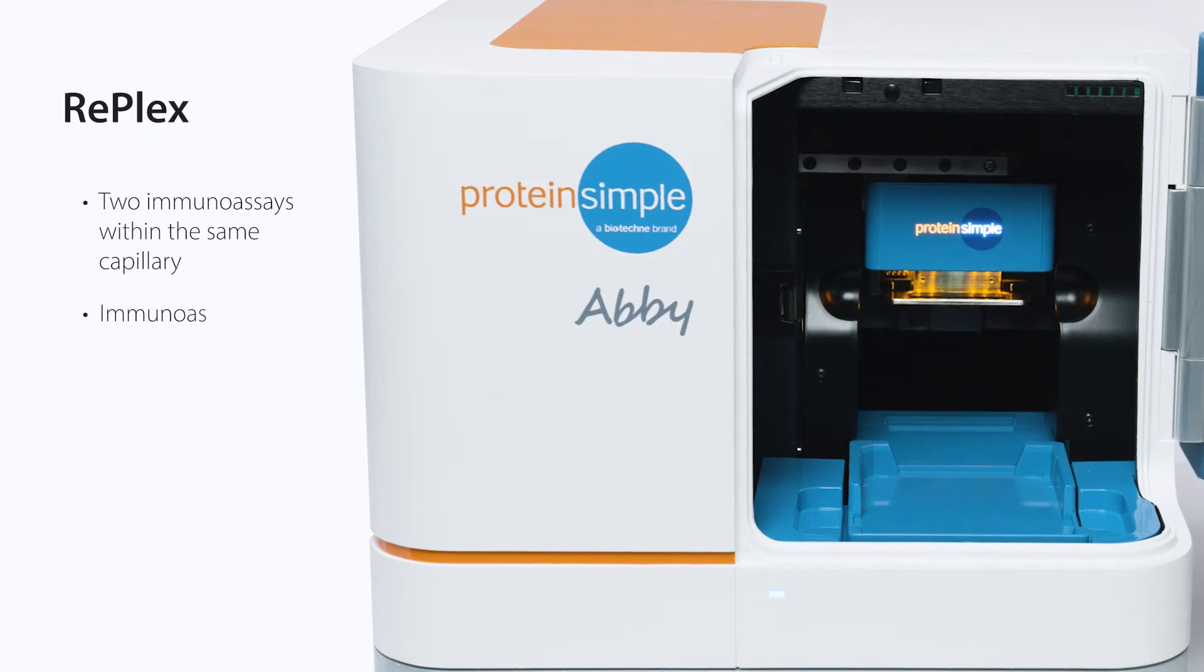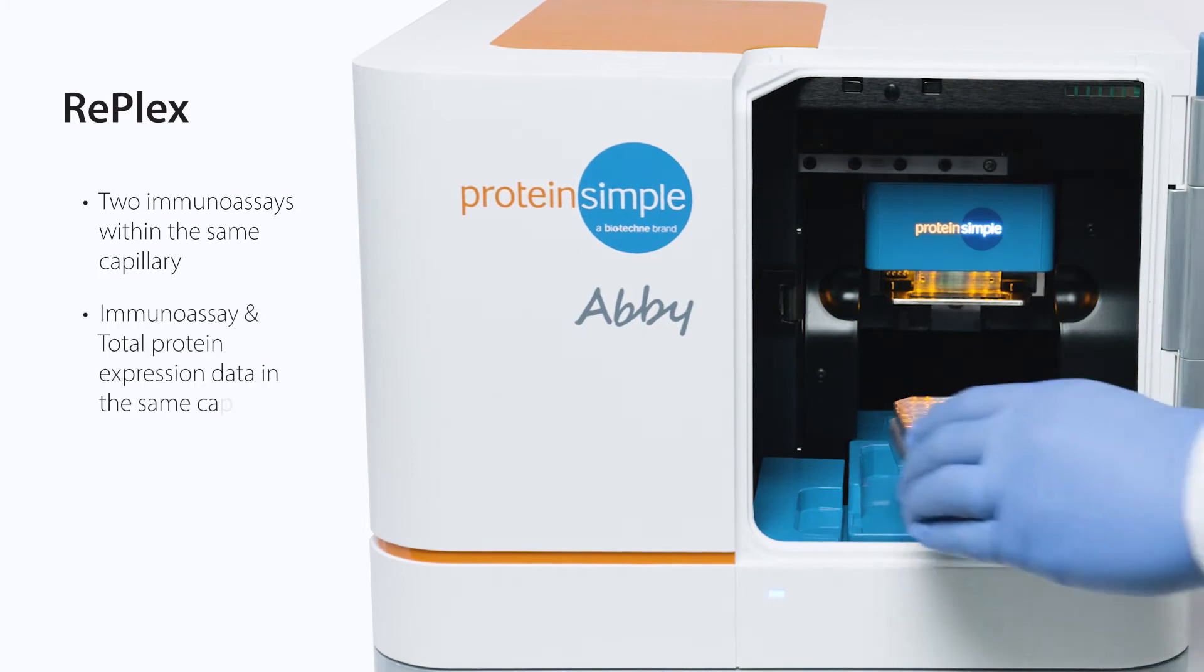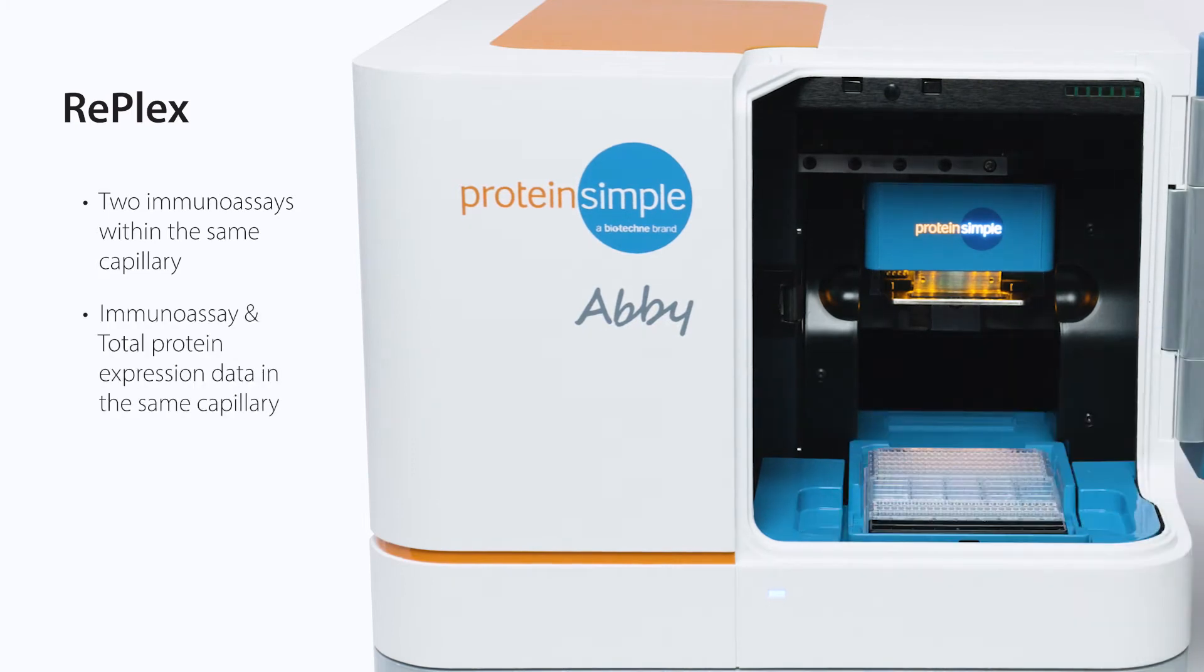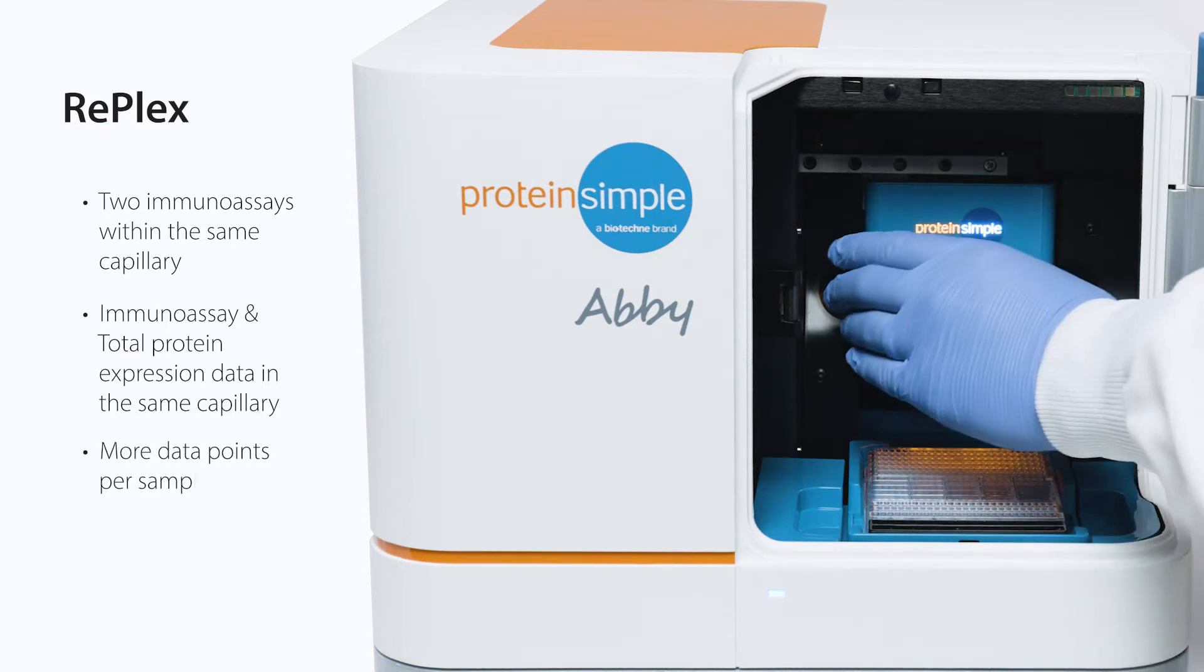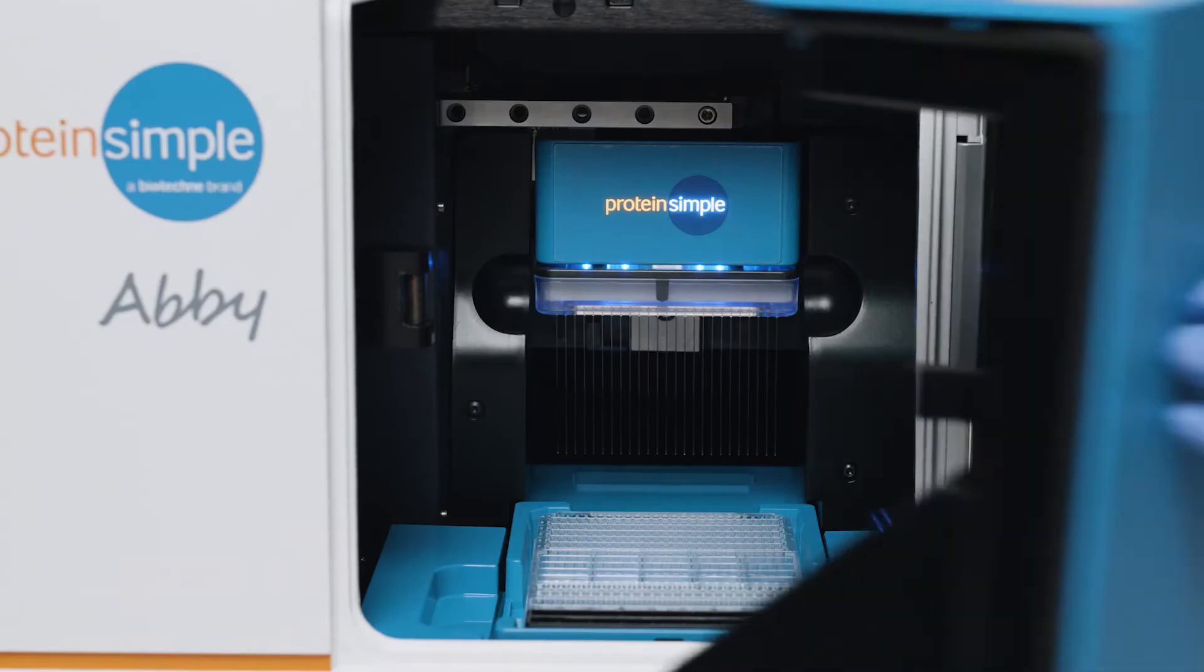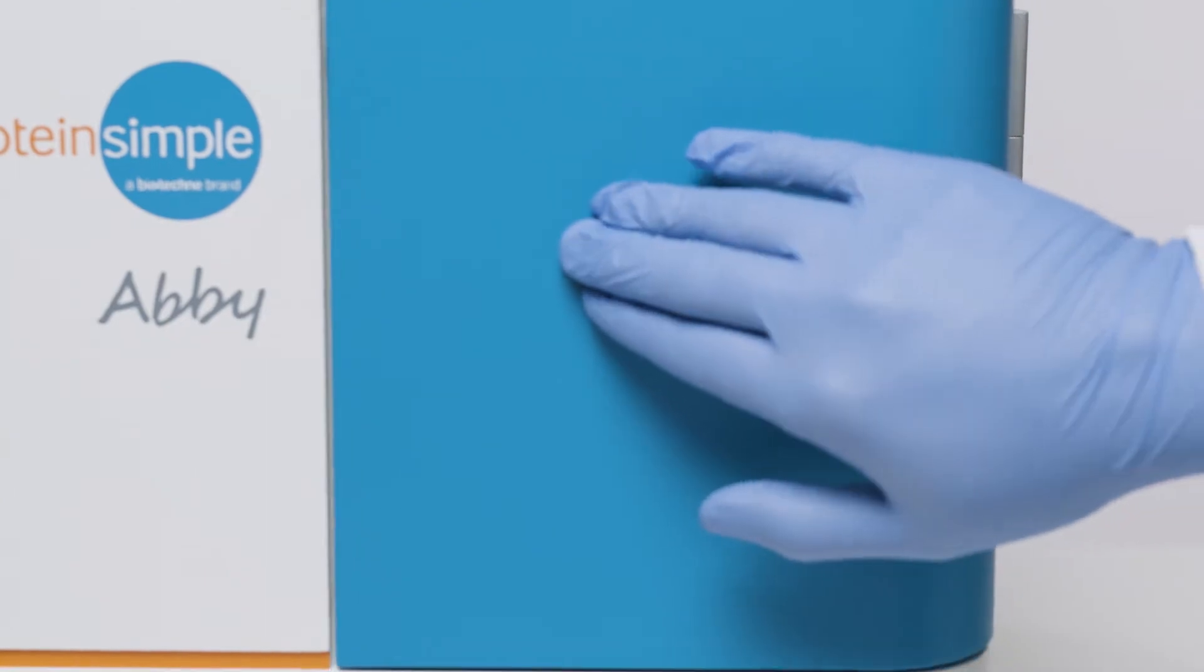RePlex also enables you to normalize your data with total protein detection in the same capillary. RePlex with Abby delivers more data points per sample, saving time and money on consumables.